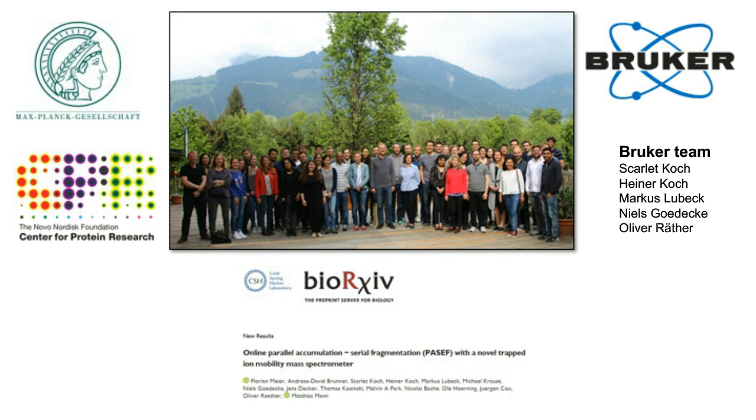Is the manuscript already published? You can find the manuscript on bioRxiv. We already uploaded it, and the easiest way is to Google online PASEF or online Parallel Accumulation, and then Mann, Meier, Brunner. Then you will find it. That's the first hit.